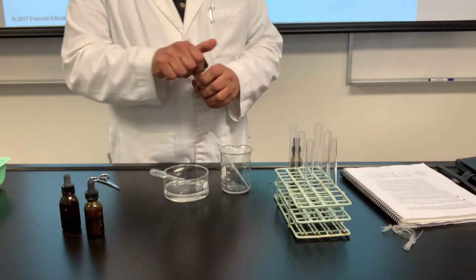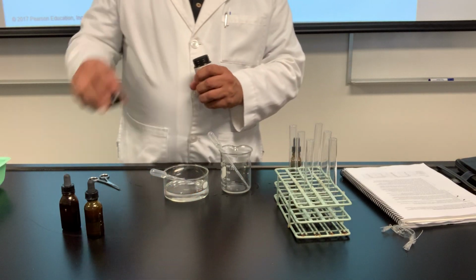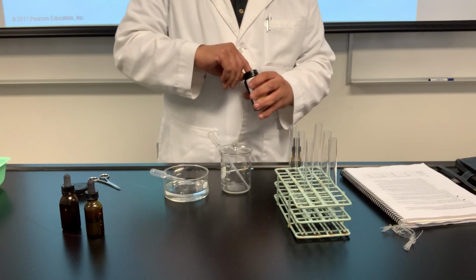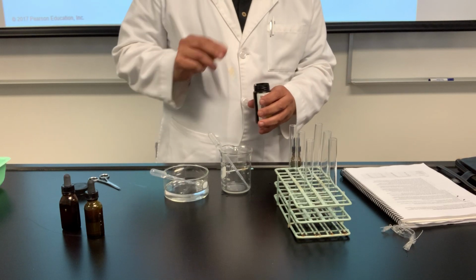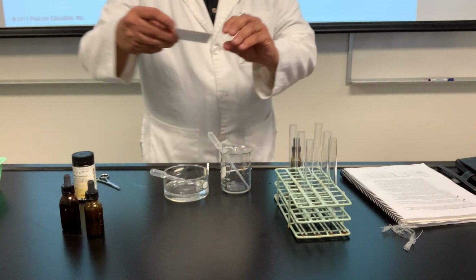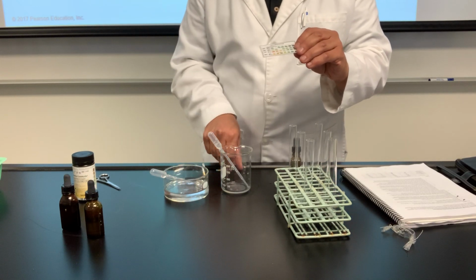Now for the protein and the glucose, we use this handy strip here. I need 2 of them. What are those? Watch. This one is testing for different things. The strip is kind of like what you would use to test your pool water or whatever.